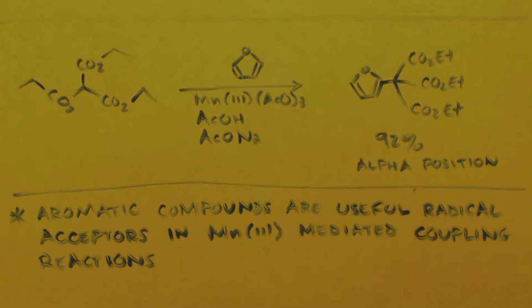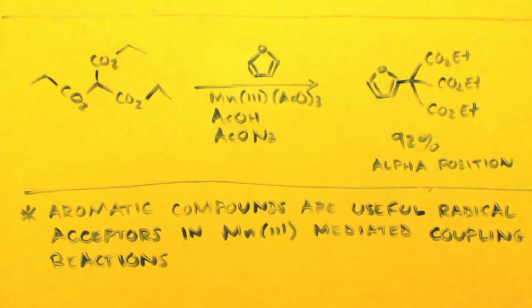Okay, I also wanted to bring something else up that is in Wikipedia. It says Mn3 acetate may be used either as its dihydrate or as anhydrous. So trying to get it anhydrous is no sense. It just sounds like extra work.